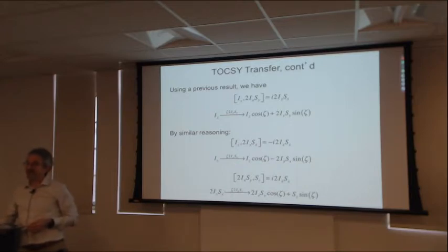Because in the CW case, you have to turn on a quite strong field. And if you apply a train of pulses, the pulse spacing has to be so short that now you're turning on a full power RF pulse at a rapid rate. And either situation was either too hard on the electronics or caused way too much heating and was too hard on your sample.